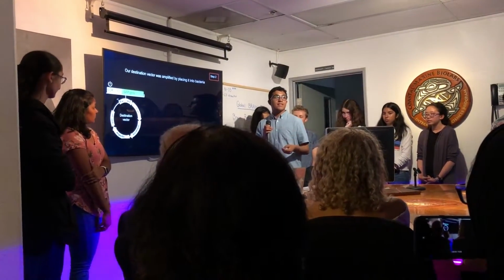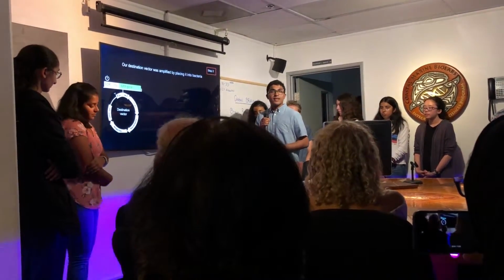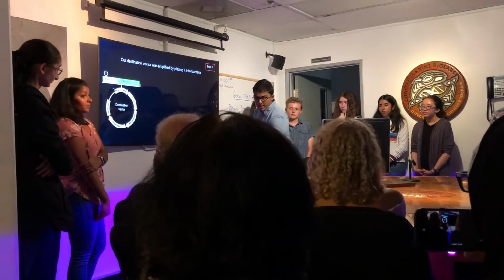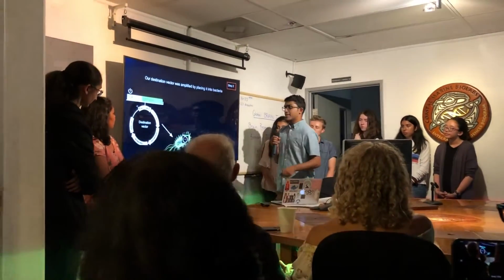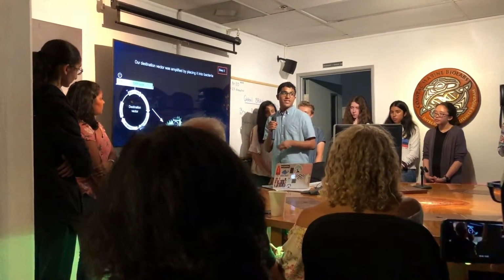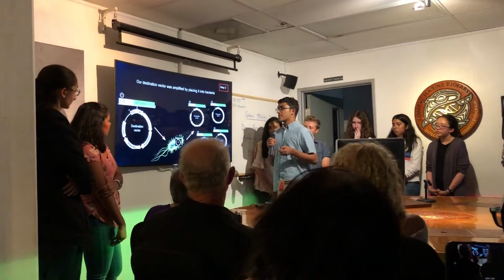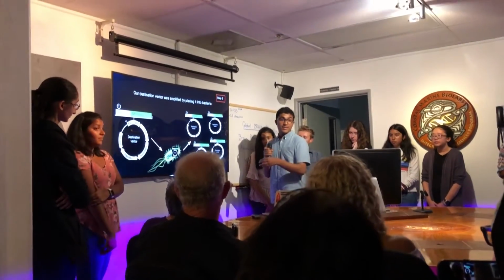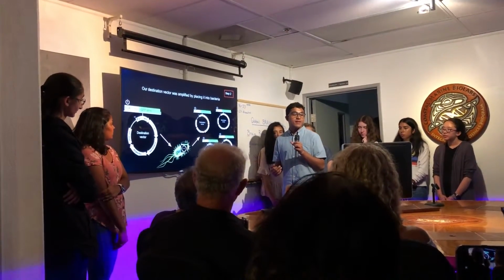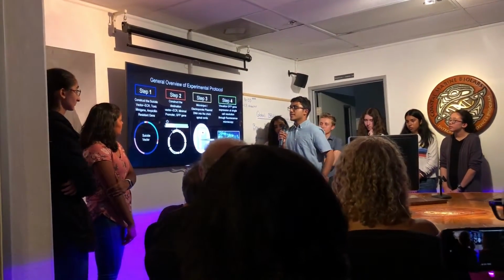But we don't have enough of the ECR to do a successful microinjection into chick embryos. So what we had to do is use the technique of bacterial amplification laid down by my colleague Sarah. So the interns put the destination vector into a bacteria, and the bacteria was allowed to proliferate and replicate on a special growth medium. Once the bacteria replicated, the destination vector replicated along with it. So eventually we have a sufficient quantity of destination vectors to be used in our microinjections. So we've just finished step 2, which is the construction of our destination vector.